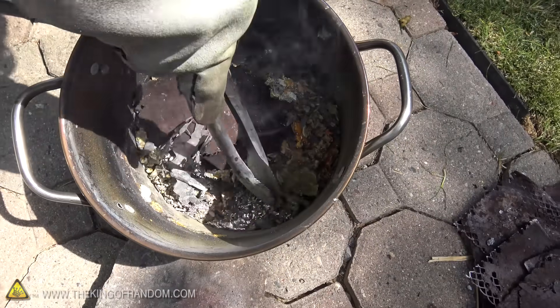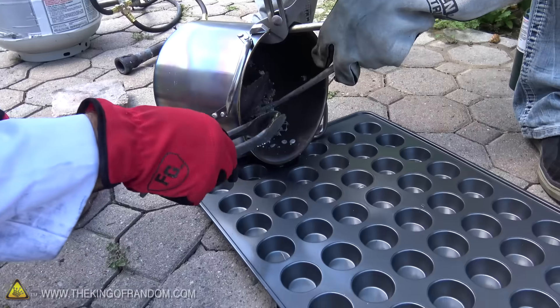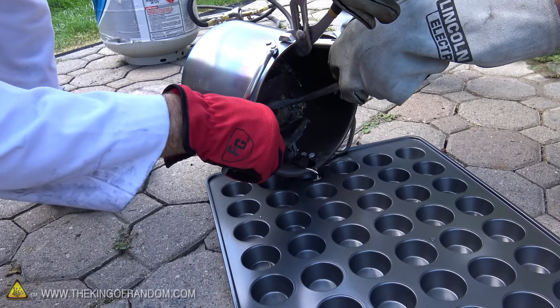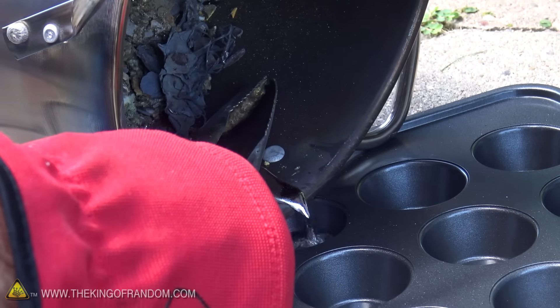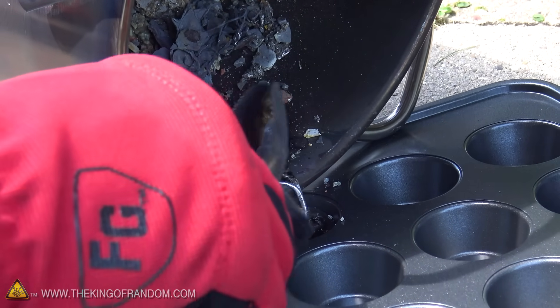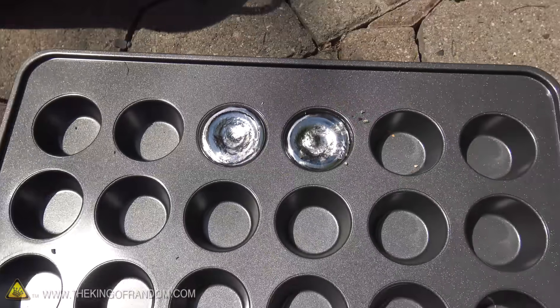We got some lead there — doesn't seem like a whole lot. There we go, that's a pretty good one. We're going to nuke all the leftovers and see if we can get any lead just to drizzle down to the bottom and then pour that out into ingots. I'm really surprised that we're not getting more than we are — I thought there would just be a ton, but that's how it's going.